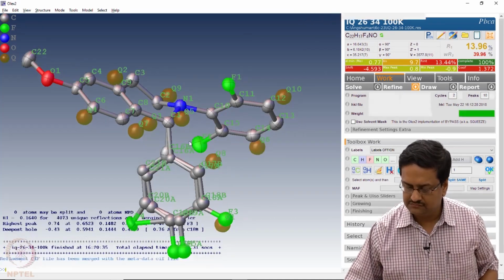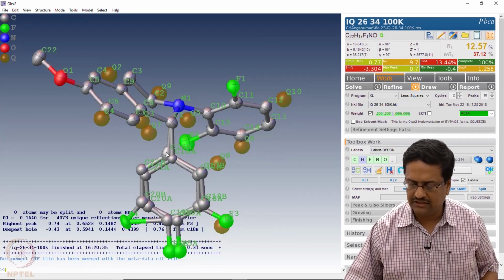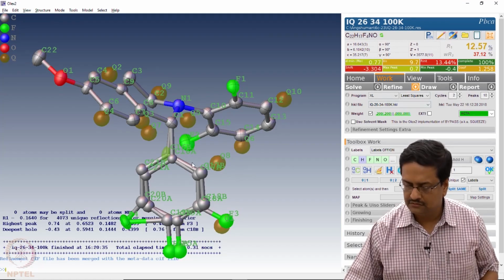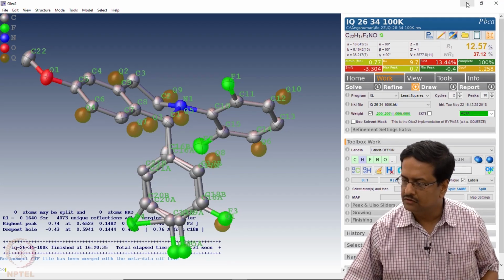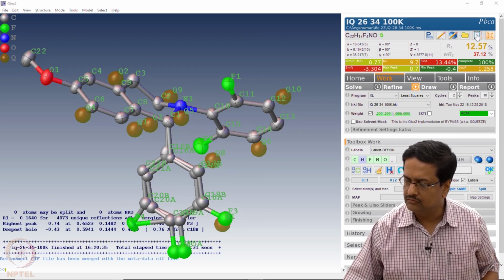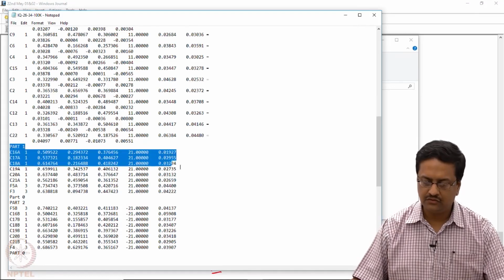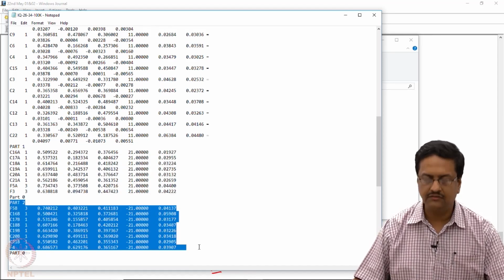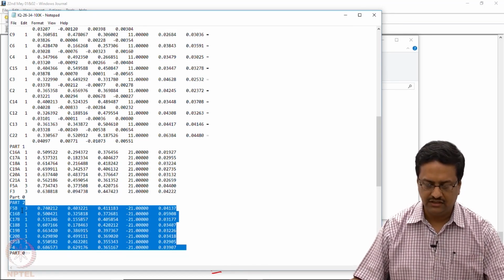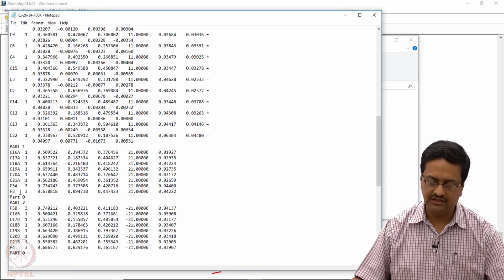Let us define ones. So now we can see two separate parts. We try to modify this atom table. So now here we have arranged the two parts in the RES file as part 1 and part 2, and you can see now all of them have isotropic thermal parameters, and the 16AB, 16B series, 17B to 21B is here and 16A to 21A is there.